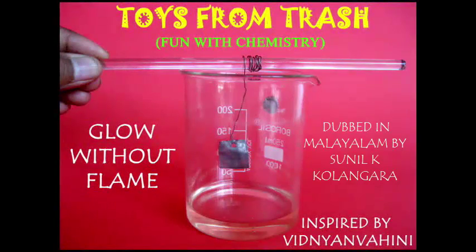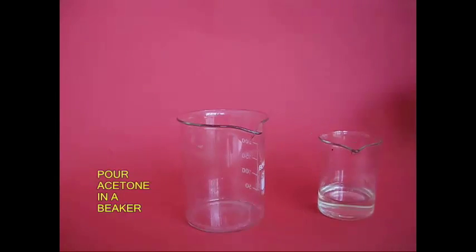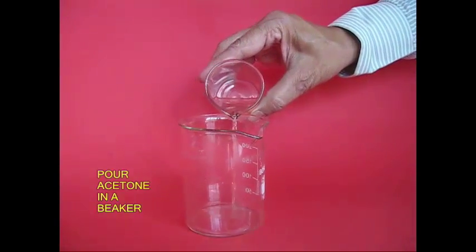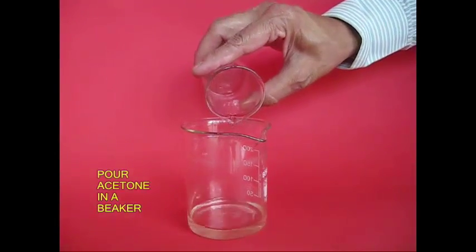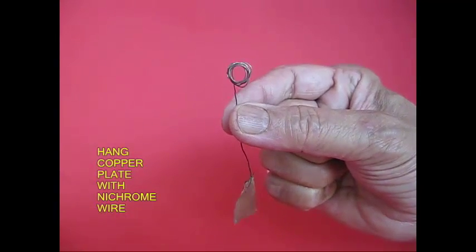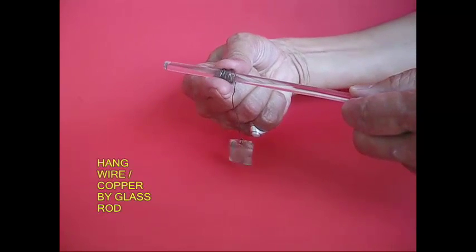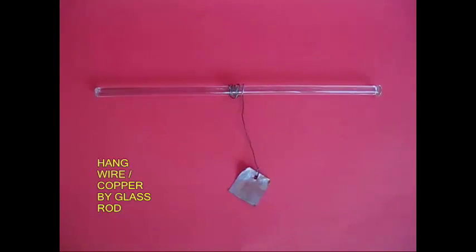A golden experiment. Materials needed: acetone in a beaker, glass rod, gas burner, a copper plate, nichrome wire. Suspend it over a Bunsen burner.